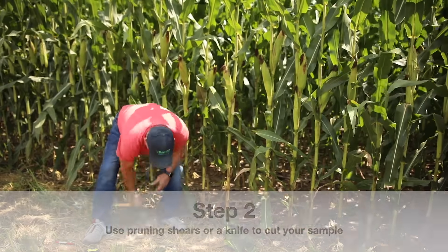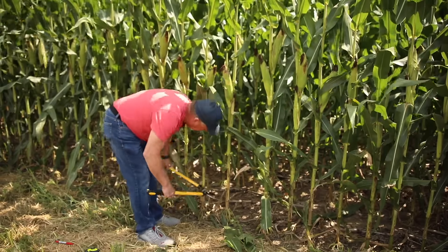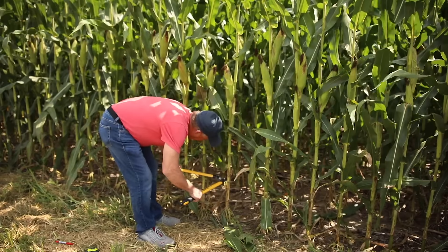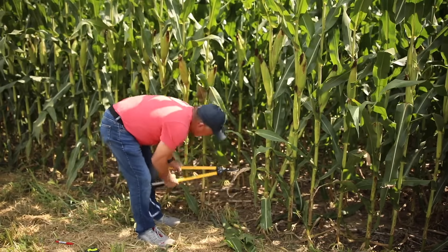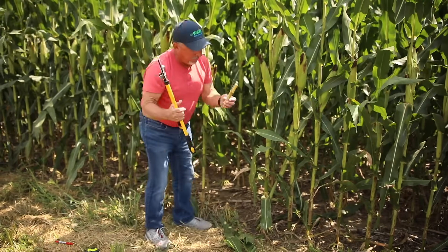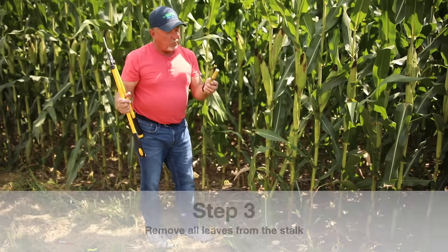I've just got some pruning shears, but you can use a knife or a sharp corn knife or anything. I'm going to take this top part first, and then just go down to the bottom mark, and there we have a sample. This one doesn't have any leaves on it — if there are any leaves you want to remove those first.